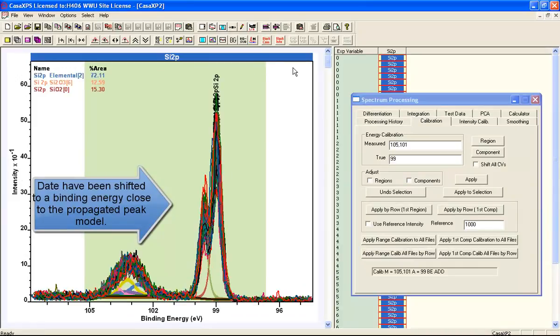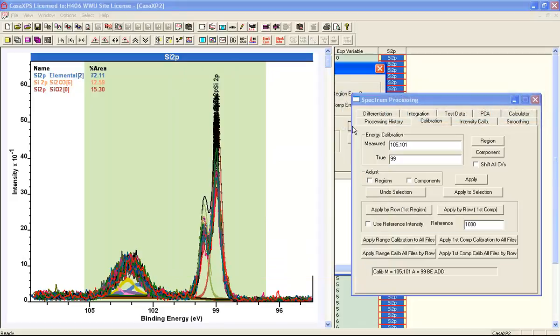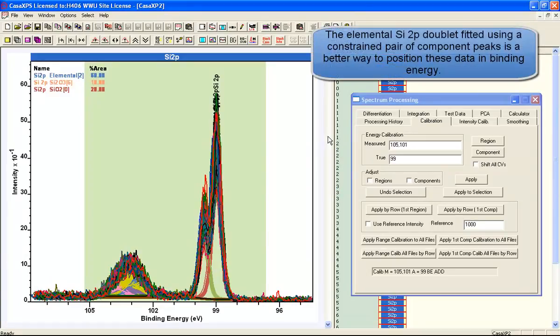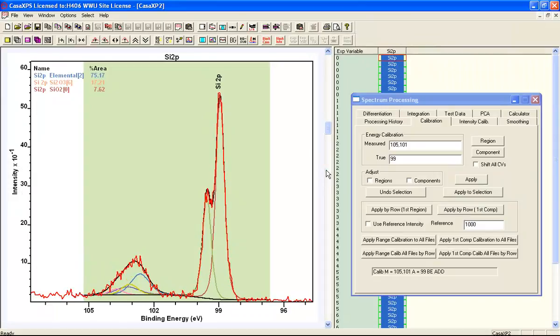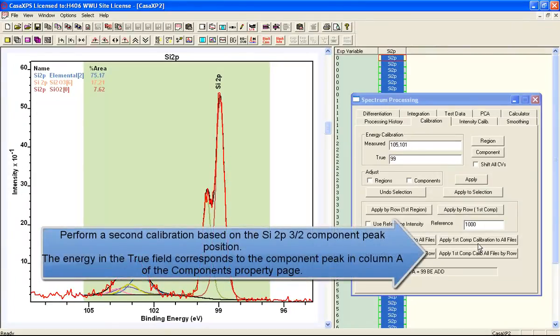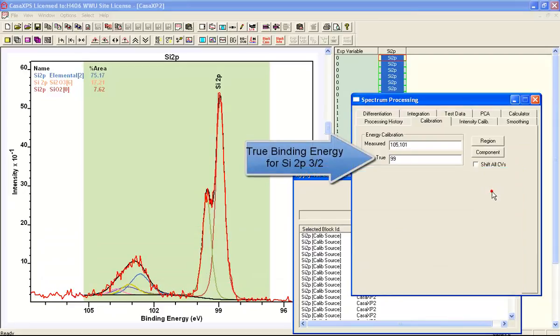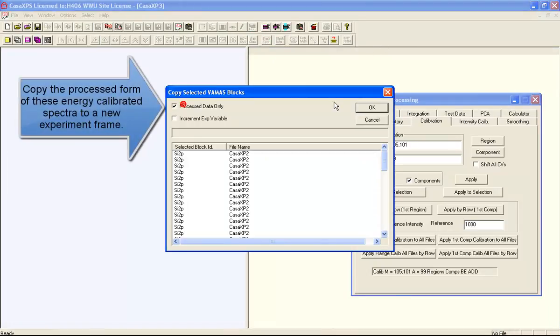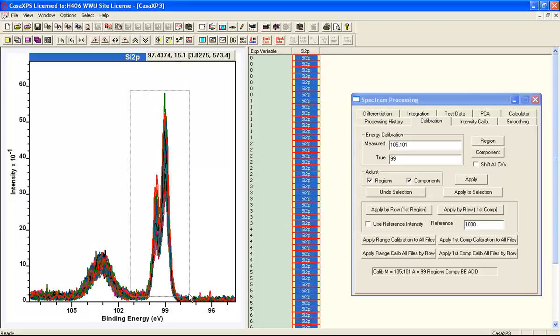We perform a rough calibration based on a range — calculating a peak maximum using an energy interval and then shifting all the spectra. We won't shift the components, because we've already positioned them with respect to the binding energy scale by virtue of the original peak model. So we're going to shift all the data so that the data align with the peak model, then propagate a peak fit to all of these data, getting the elemental peak in the correct position using the doublet, and create a new file containing the calibrated spectra all aligned for the silicon 2P elemental doublet.